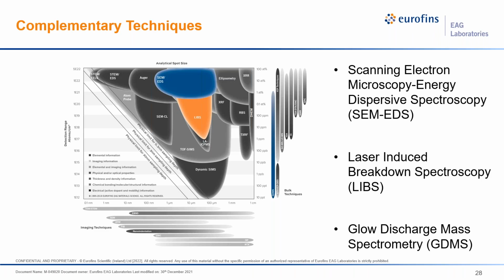However, it uses a much bigger spot size than laser ablation. So LA-ICP-MS can be used subsequently to quantify particular analytes of interest using an independent technique that's completely different than GDMS. Or if you suspect that there is spatial variation in your samples that is actually quite important to your goals and objectives, and you need finer spatial resolution than GDMS can offer, then this might get shunted over to laser ablation instead of GDMS or in addition to it.